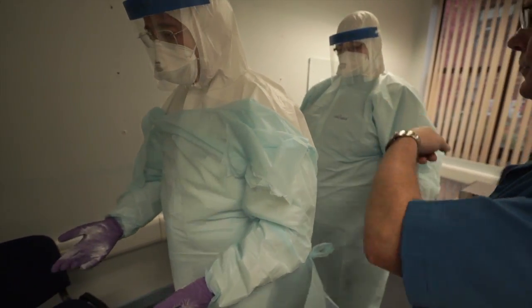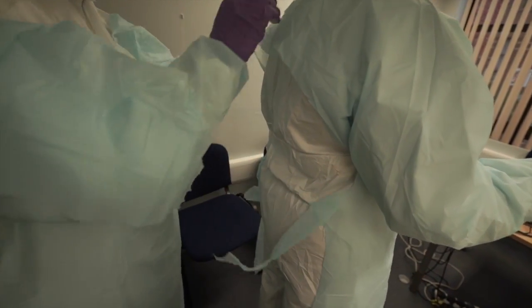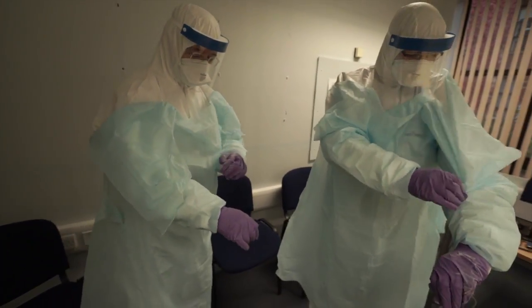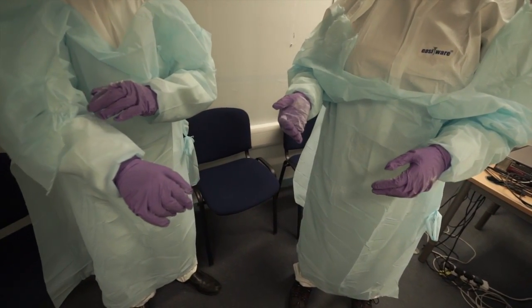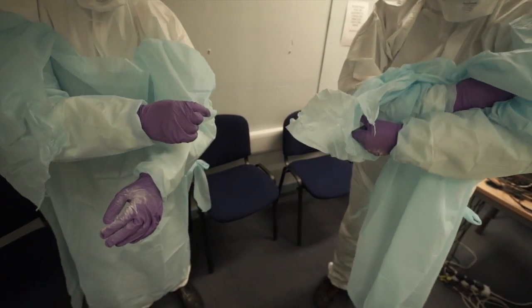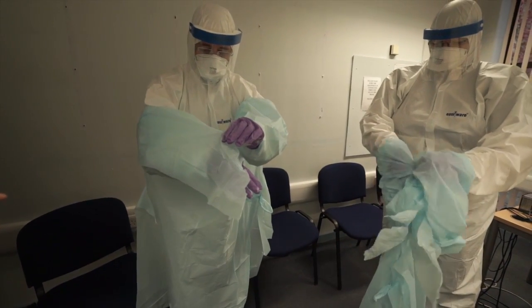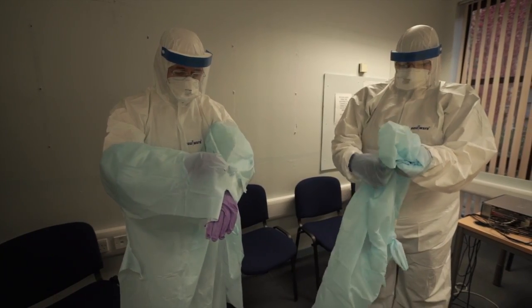Do the same with your apron for Sarah. Excellent — just slide this off the shoulders as well. Now, if you hold pause there: it is imperative that you fold this all in on itself so you get none of the outside touching your inside. When you get down to the wrists, the outer pair of gloves come off at the same time with that apron. Pull your apron up into a ball, Sarah — roll it all up into a ball.